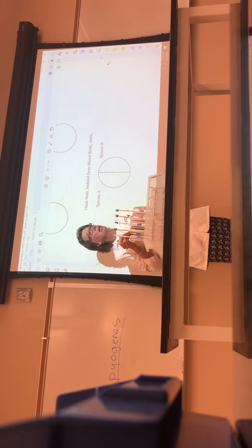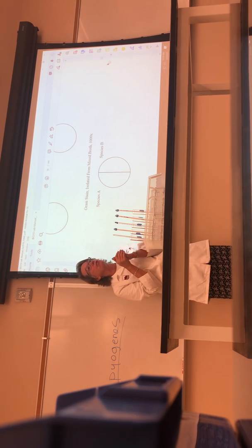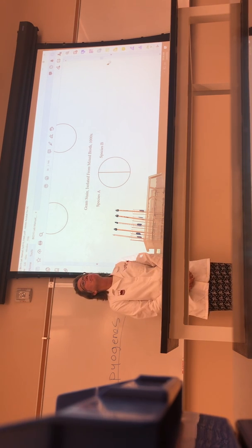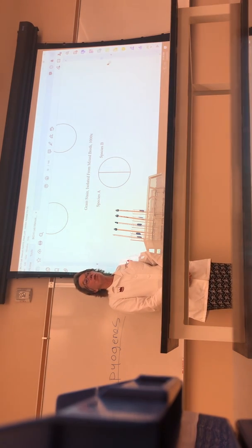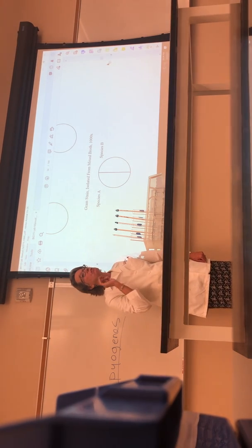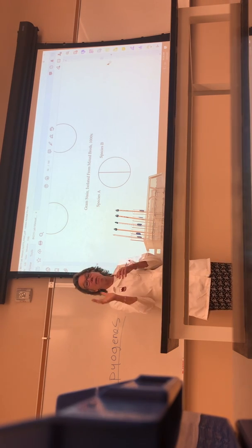You're going to take a teeny bit of that colony and streak it for isolation on a new plate. I'm going to come around and eyeball people's plates and slants and make sure you understand. So what are you all going to do with your slant? Gram stain it, just to make sure it is what you think it is. From your plates, however, you're going to take a small amount of your missing one, which is probably your gram positive, and streak it for isolation on a new plate. I'm going to come around and look at your plate.